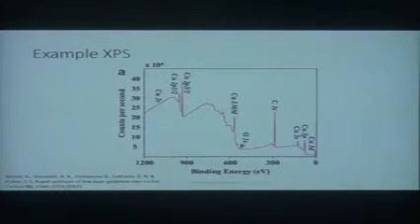I'm slightly dyslexic. It means that the numbers go in the wrong direction. Right? It's because it's binding energy. It starts from 0 on the right and then goes up this way. It's because of that. Really, the binding energy is a derived quantity. It's subtracted. So you go through this and you see these very sharp peaks.